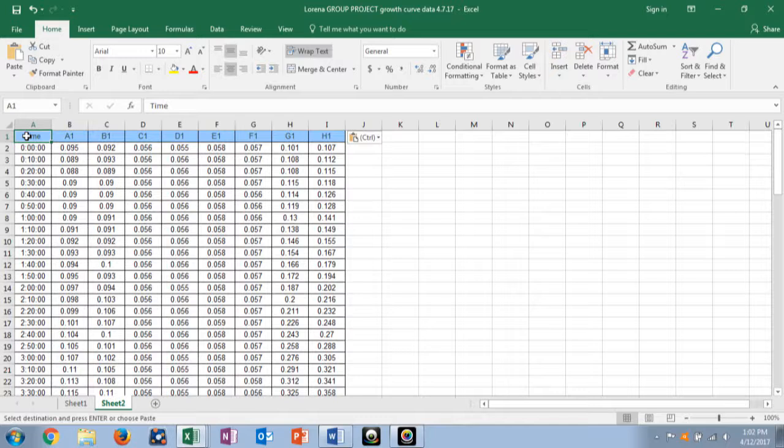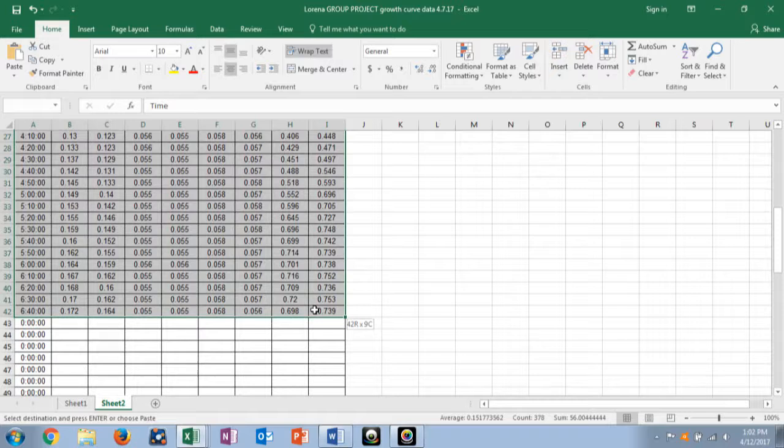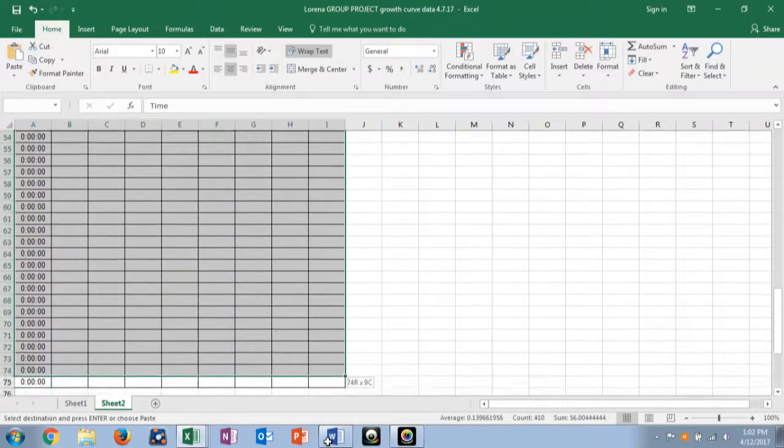So I actually pasted this up too high. Let's just highlight this whole thing. Don't paste yours in the first section.